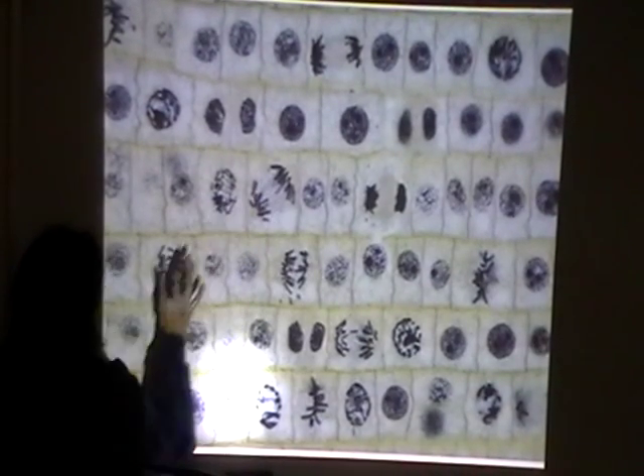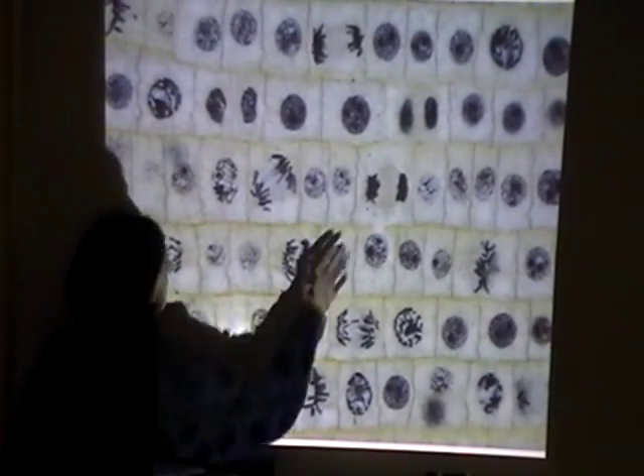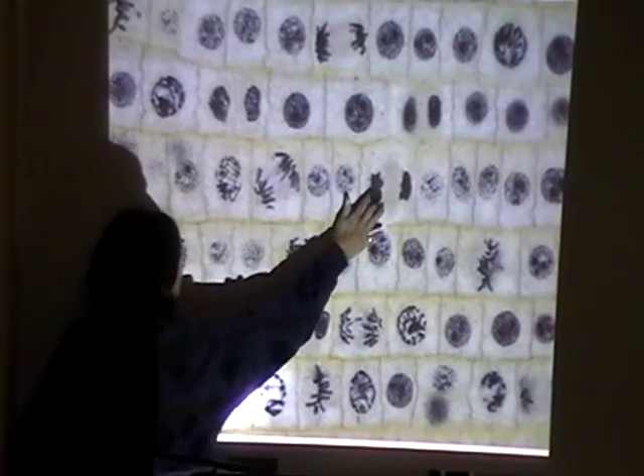Then we move on to the anaphase — we have lots of anaphase here, anaphase here, beginning of anaphase, and anaphase here.